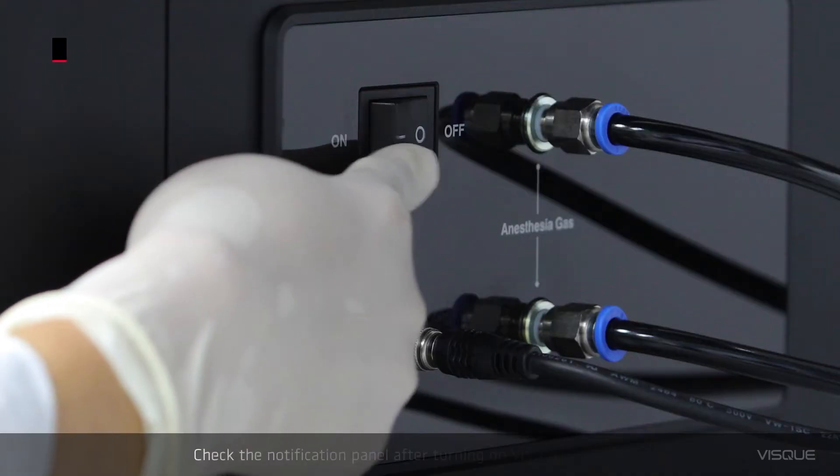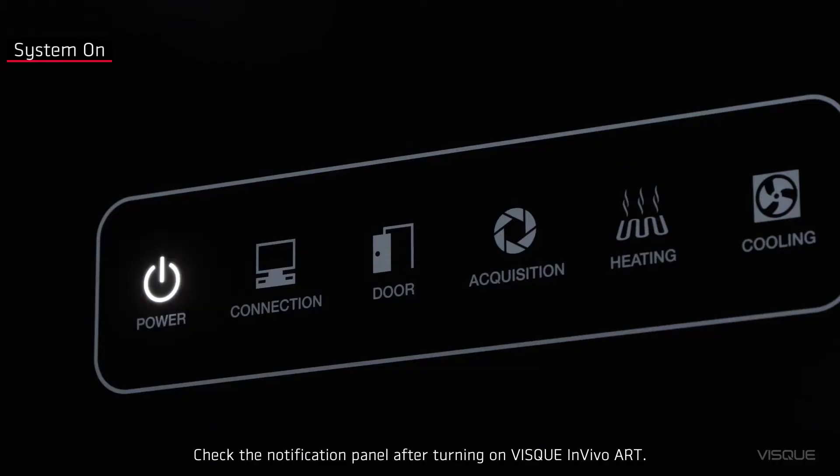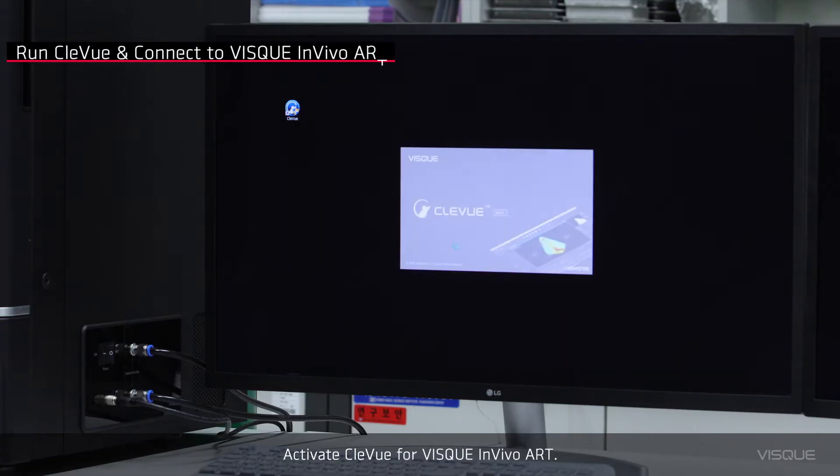Check the notification panel after turning on Viscue in Vivo Art. Activate Cleview for Viscue in Vivo Art.